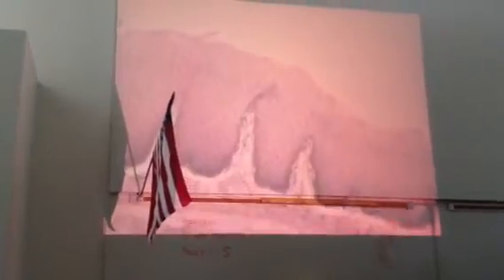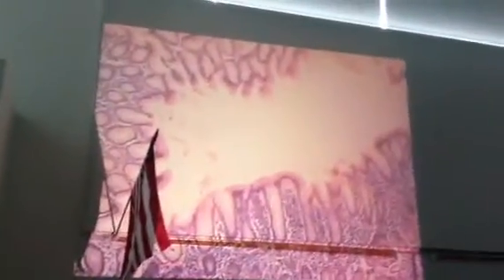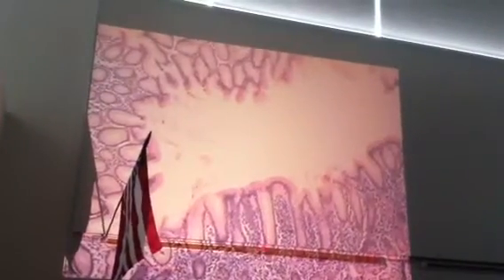This is the esophagus, excuse me. Stratified squamous, non-keratinized epithelium. Cells are alive all the way out to the surface. We come over this way to the stomach-esophagus junction, and as I mentioned, this is the opening of the gastric pit. That's a gastric pit.